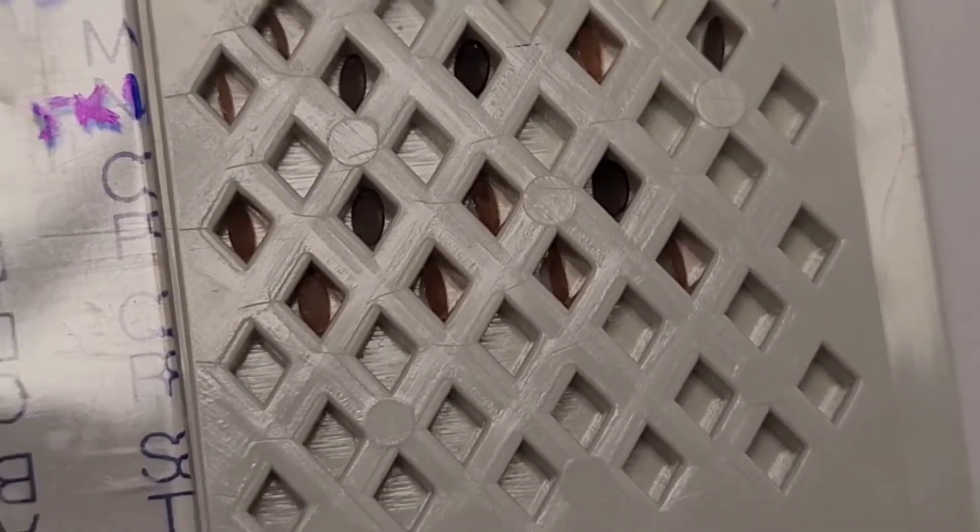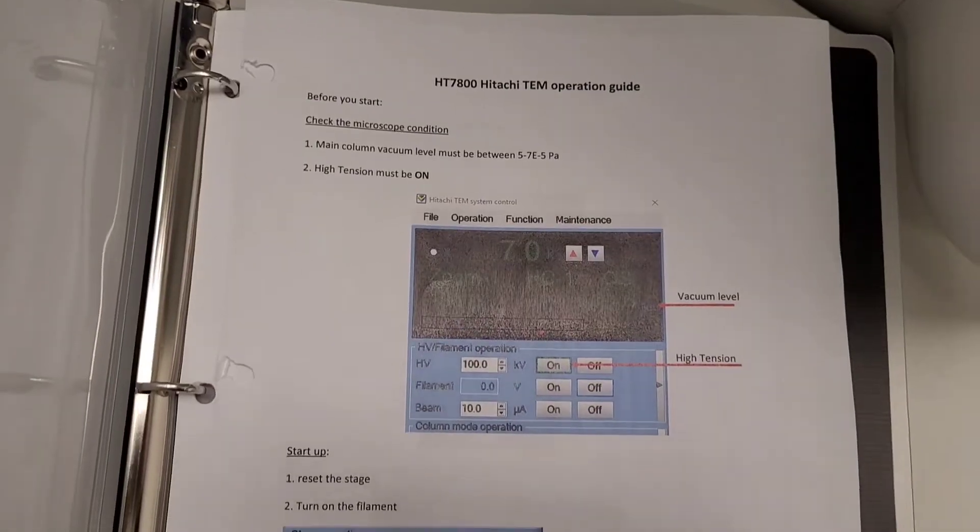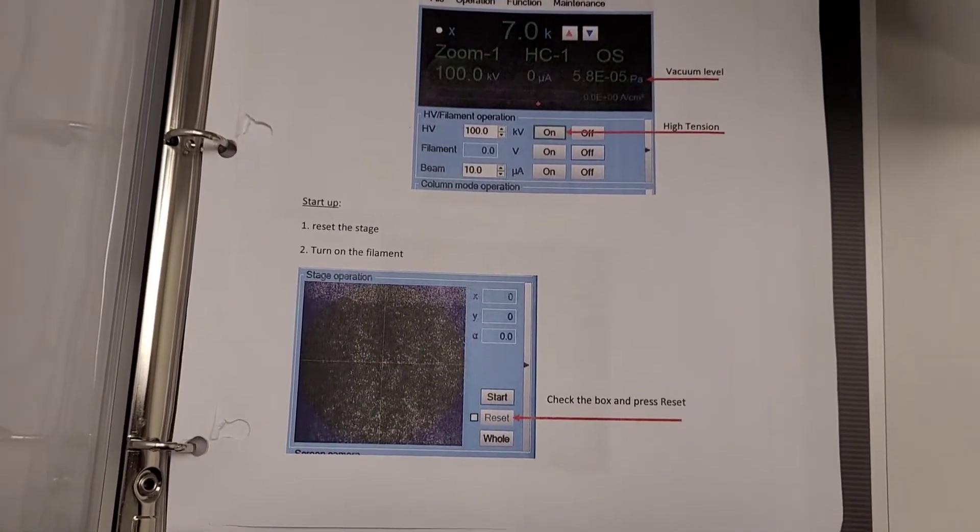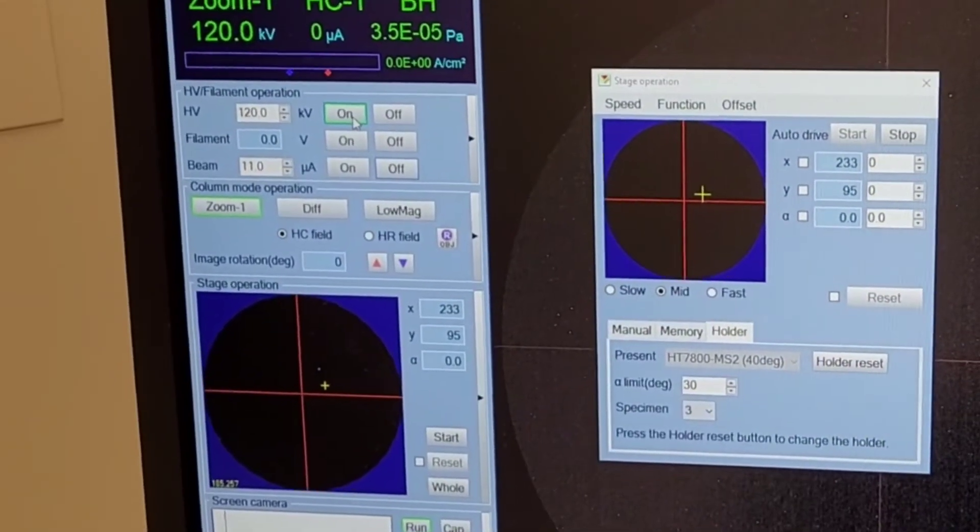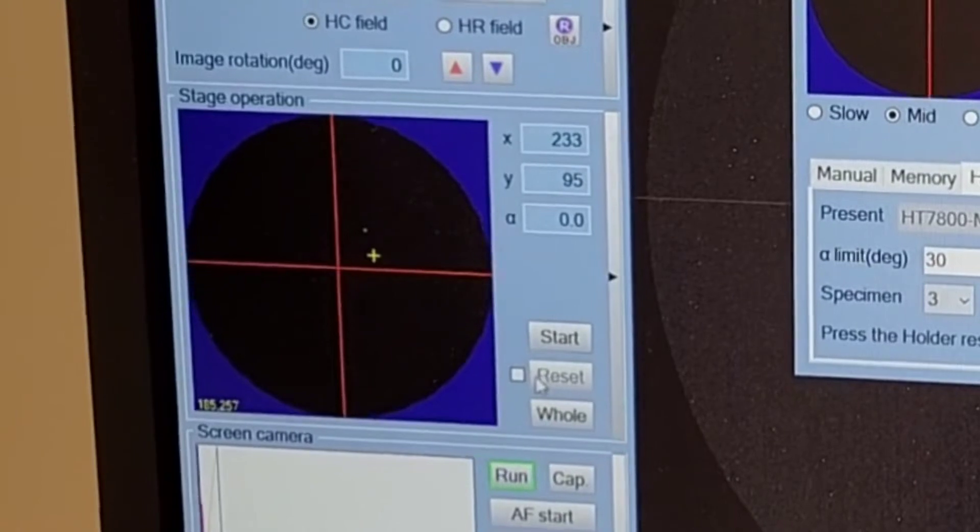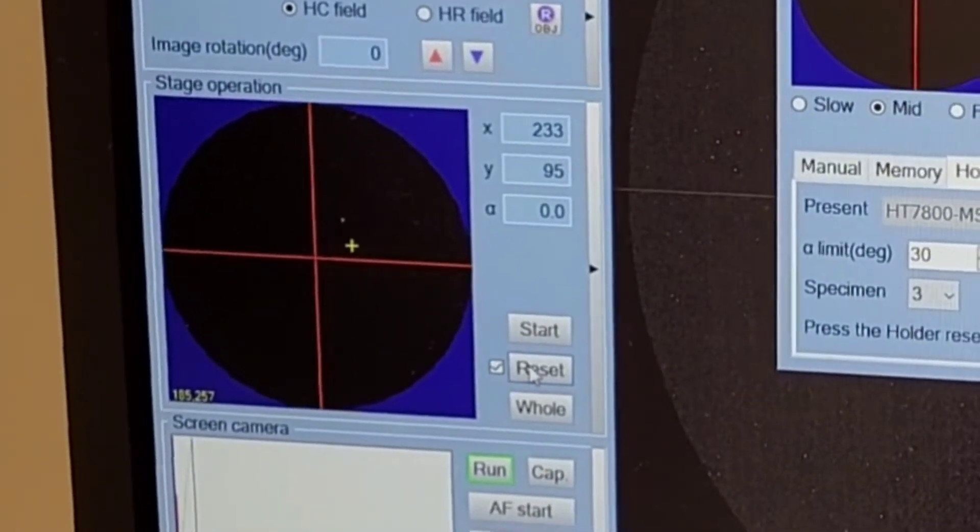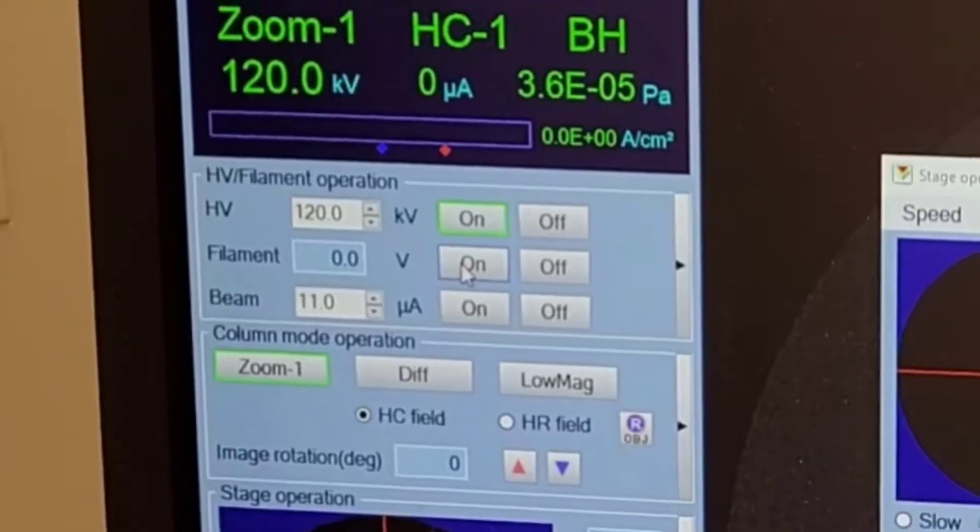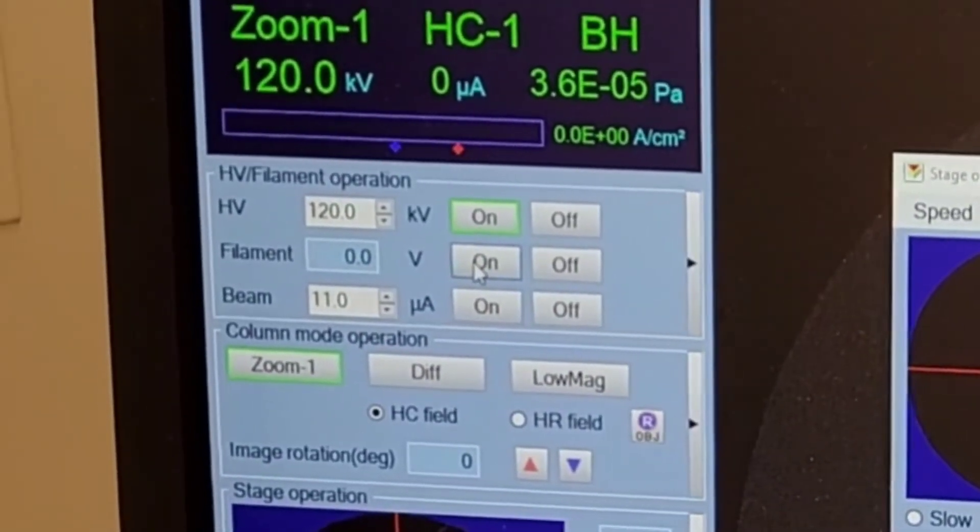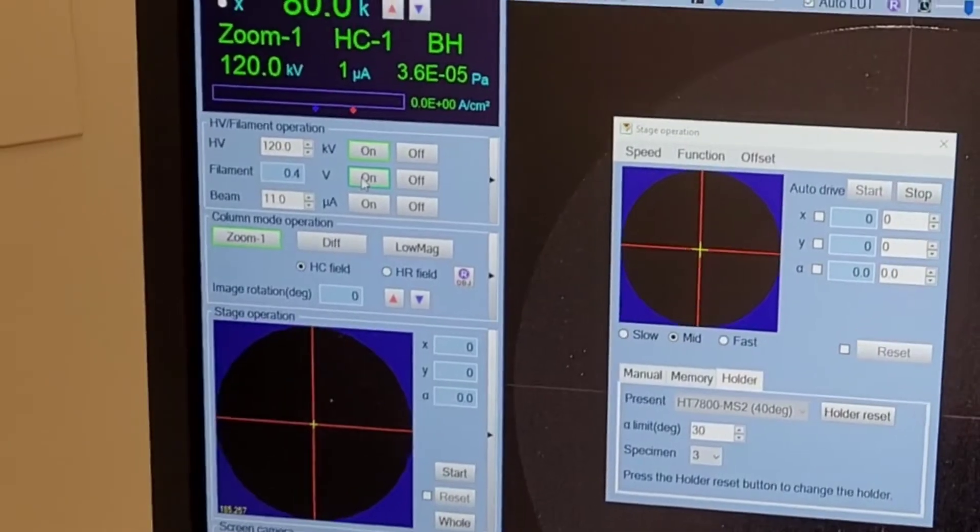This one is better than the one I've shown before because you can load up to three samples at a time. The first thing is to reset the stage and then you want to turn on the filament and then you want to give this some time, maybe five minutes after turning it on.